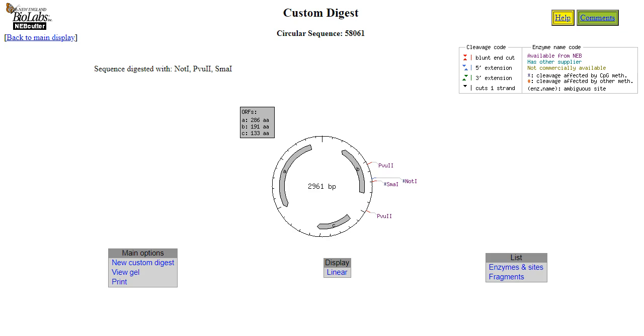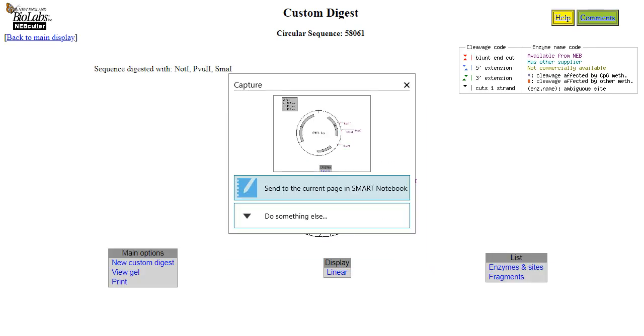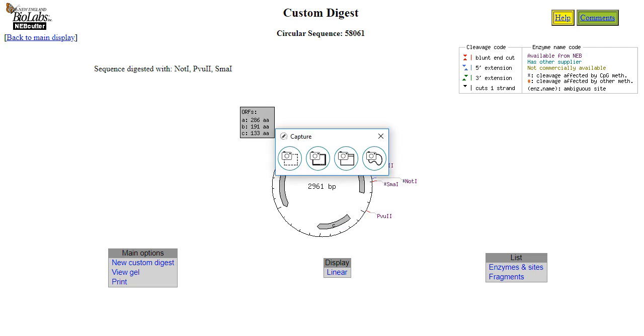So what I do here is I go, well, is this the one I want to use? You might get lucky and actually land on it on the first try, but you kind of got to check both. Where'd my marker go? There it is. Okay, so Sma1 is my restriction endonuclease number 1. And that's not working out for me. Hold on a second, let me just do a quick little cut. All right, that's going to be loud on your video, so plug your ears. Okay, so there's that one.